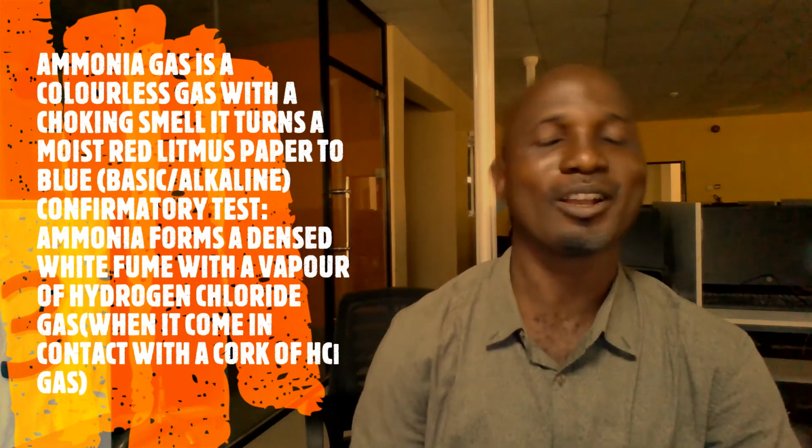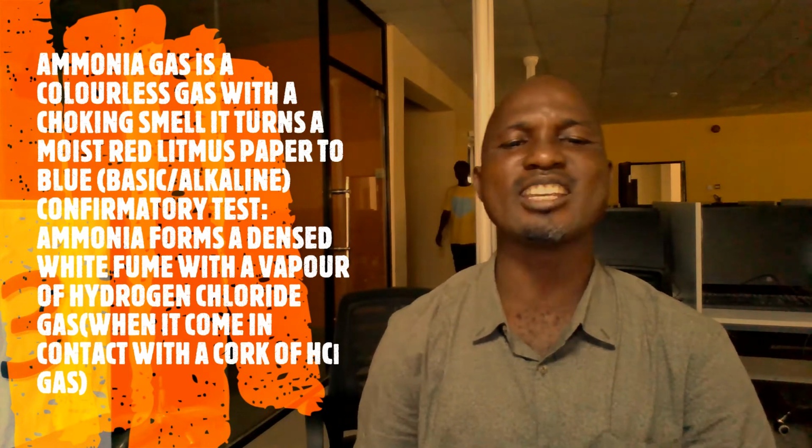Ammonia gas is a colorless gas, but it has a choking smell. This smell usually is a characteristic of ammonia gas. And ammonia gas can be tested in the laboratory just like when we tested for our hydrogen chloride gas.